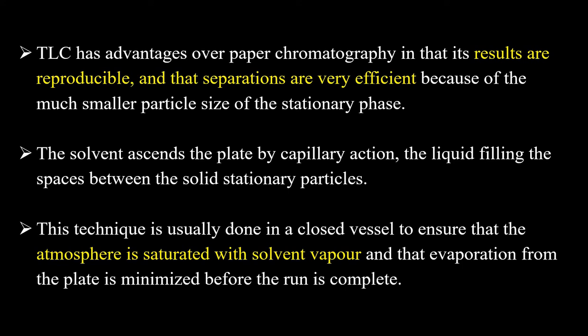The solvent ascends the plate by capillary action, the liquid filling the spaces between the solid stationary particles. This technique is usually done in a closed vessel so as to ensure that the atmosphere is saturated with solvent vapor.